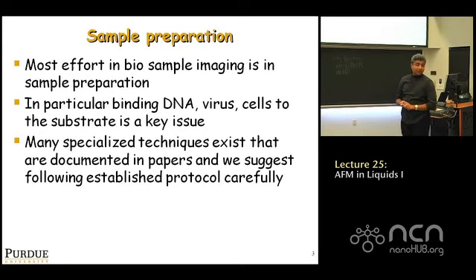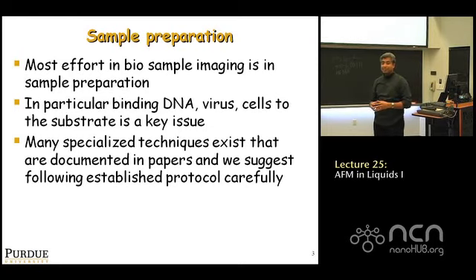So if you follow the literature and look at the materials and methods section of every paper published, they will describe in detail the method they use to immobilize whatever biological sample they are studying. So I encourage you to follow some of those recipes carefully and apply it to your own sample.